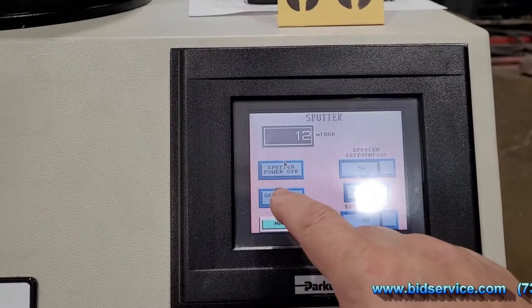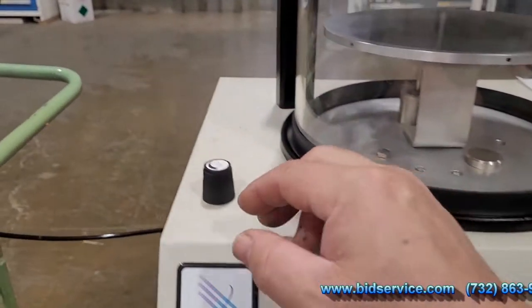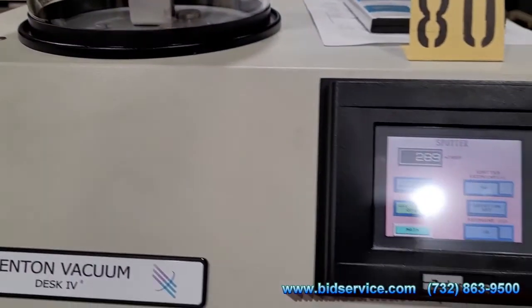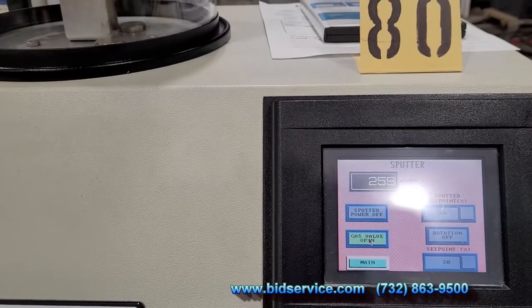Over here I'm going to open up the gas valve. To adjust the gas valve is this little knob right here. I pretty much preset it to around 270 or 250 millitorr.